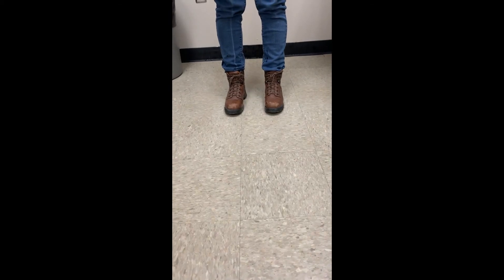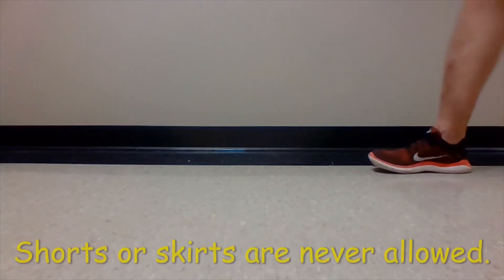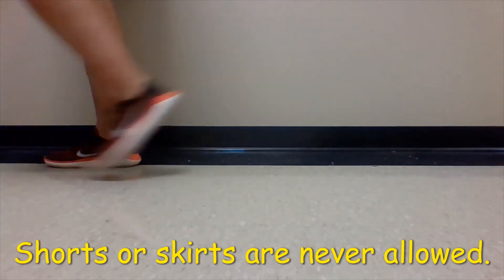Proper shoes for lab cover your entire foot and are liquid repellent. And shorts or skirts are never allowed in the lab.